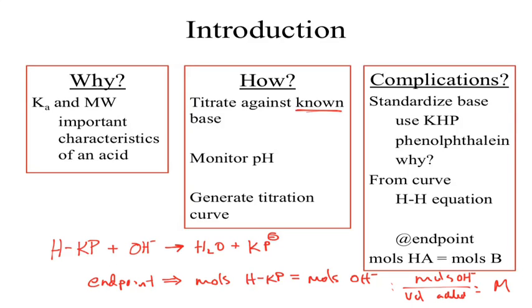When it comes to the pH titration, everybody does that individually. So you will do 2 standardization trials and 1 pH titration. Every single person does. That will help out at the end, because then you can compare your results of your pH titration to your partner, and they should be the same. If they're drastically different, when you go through and determine the calculations, we can try and figure out who did it more correctly, and you can use that 1 set of data. But everybody should do that whole titration.